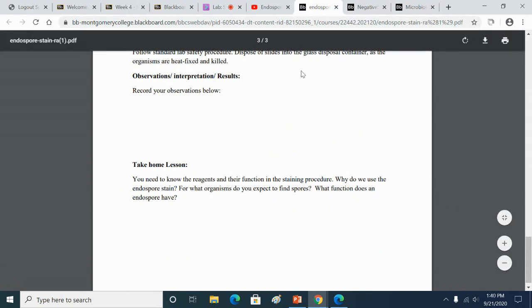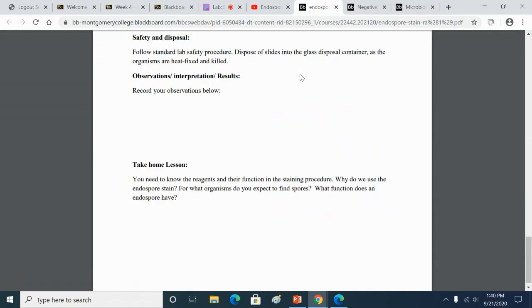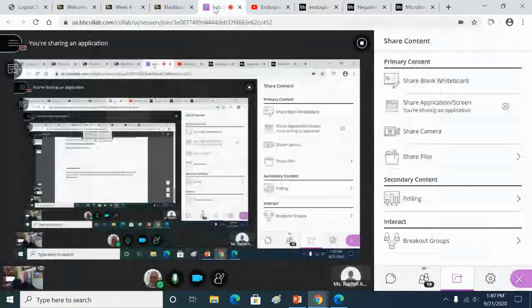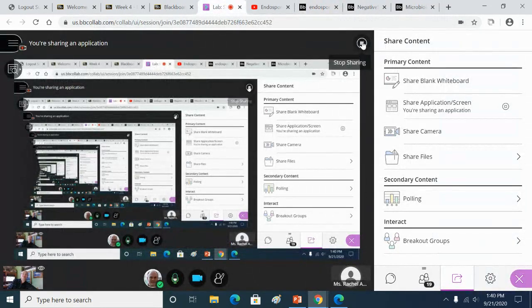Not everyone necessarily does the staining procedures the exact same way, right? Because there are variations in terms of how you can do some of these procedures, and they give you the same kinds of results. So no questions or comments?